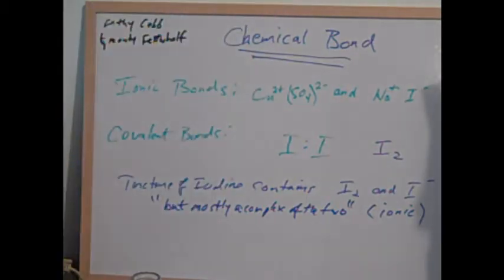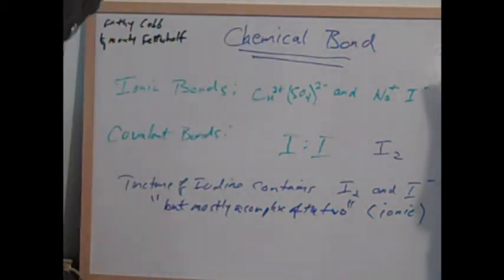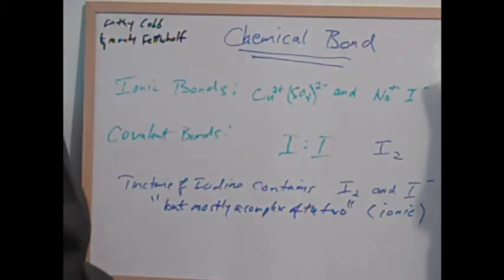The second part of the demonstration has us add ammonia to our copper sulfate solution, which is sort of a dull brownish gray. It's supposed to be blue. And the mineral oil iodine mixture, a few milliliters. We'll add a lot, actually.